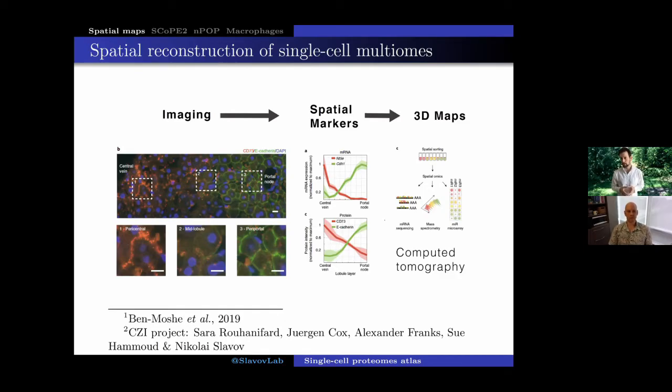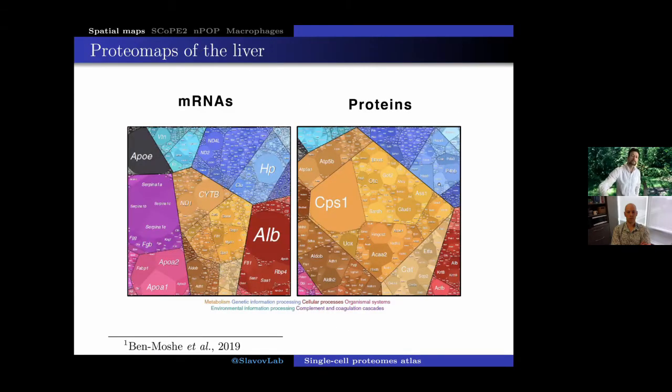So most of what I'm going to talk about today is going to be focused on the single cell protein analysis, which is a part of this last component. How do we measure the high dimensional single cell proteomes so then we can use them to build the single cell resolution atlases? And as we think of atlases, it's useful to take a step back and look at what people have already achieved in building joint RNA and protein atlases of different tissues and see what we learned from that.